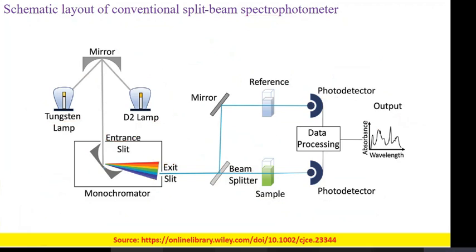Okay, if you look into this grating, what is happening is that when your sample is being incident, if you place your detector, in this case the image sensor, closer to the grating, the image which will be found will be in a smaller region. You're getting my point? Everything is in a very congested manner. All the wavelengths are in a congested manner.